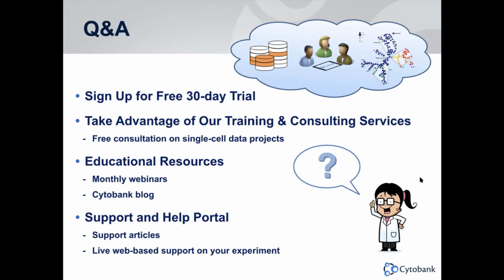So it really depends on your experiment setup. If you are using other genomic data other than cytometry data, probably you could go very low to run Citrus. So yeah, we can discuss that more. If you have further questions regarding this, just write to us at support@cytobank.org. We'll be happy to take that discussion from there.